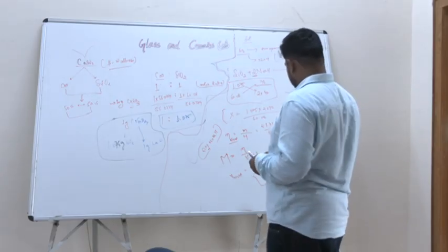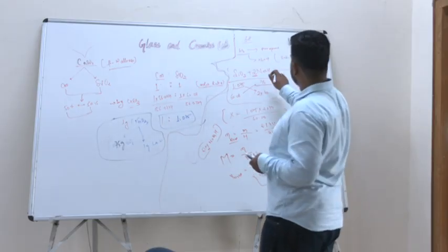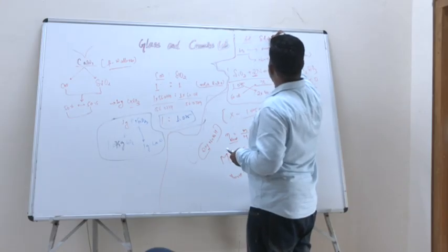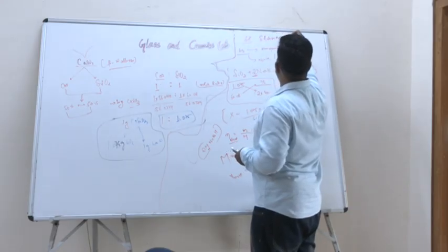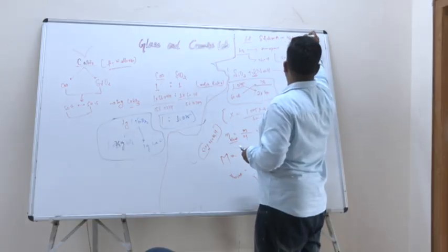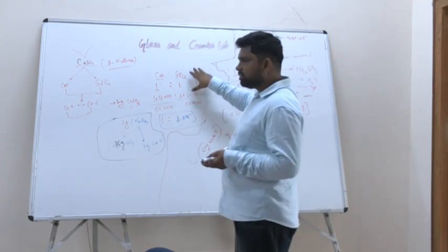So this will be our solution A. Solution A is the sodium silicate solution. Okay, you have noted this one?